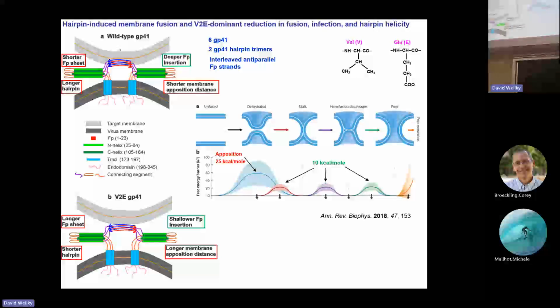backbones of the two beta sheets would be about 10 angstroms apart, so that for our measurements they will not contribute to the signal. Because we're focused on the interstrand hydrogen bonding. It's really 4, 5, 6 angstrom carbon-nitrogen distances.